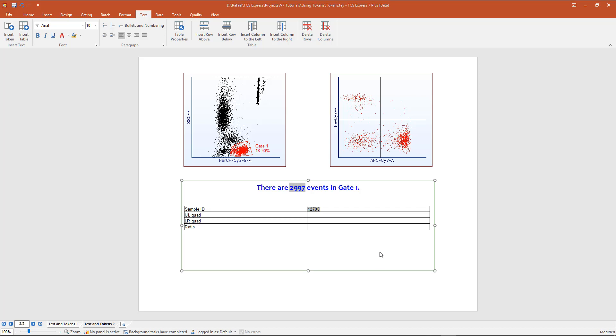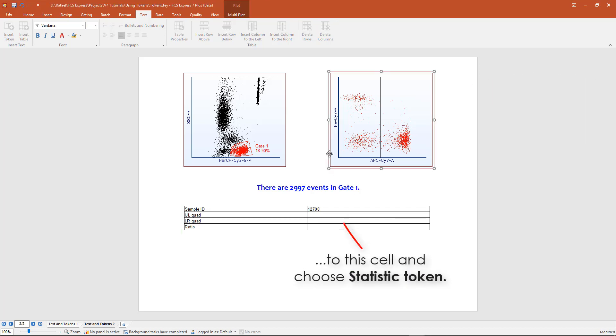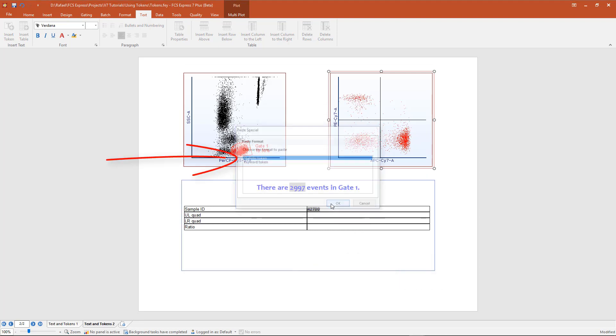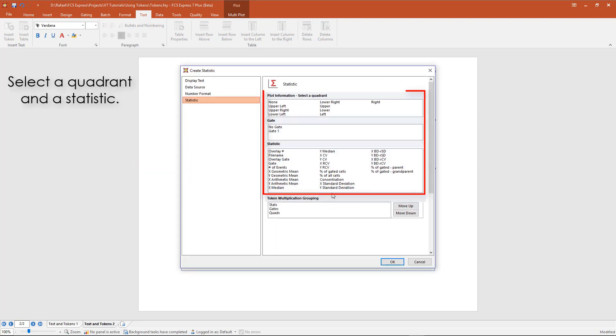To create a statistic, we can drag the plot on the right into a cell and choose Statistic Token. Under the Plot Information section, select a quadrant, then select a statistic.